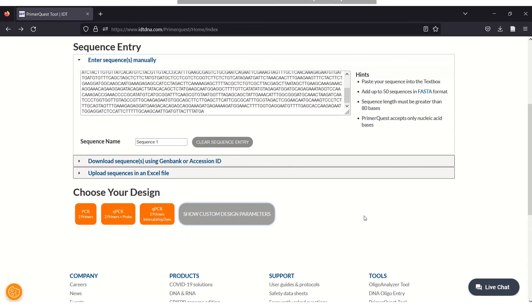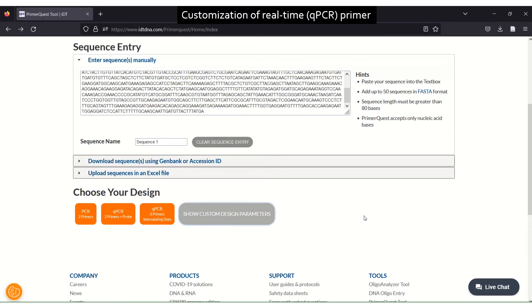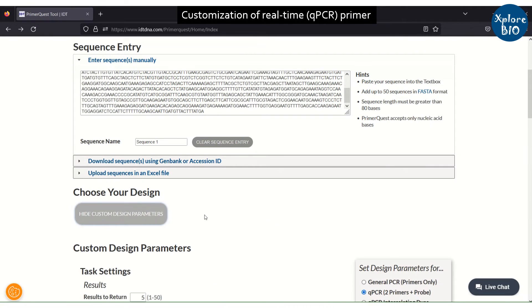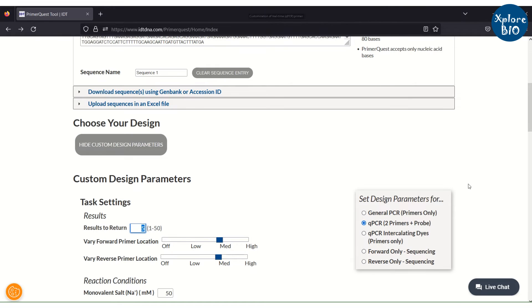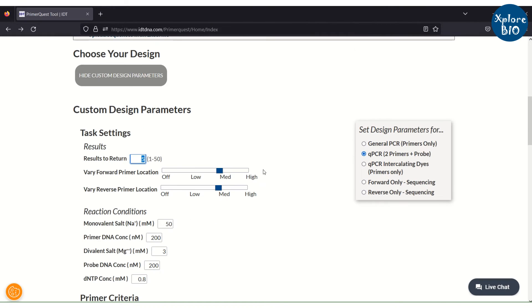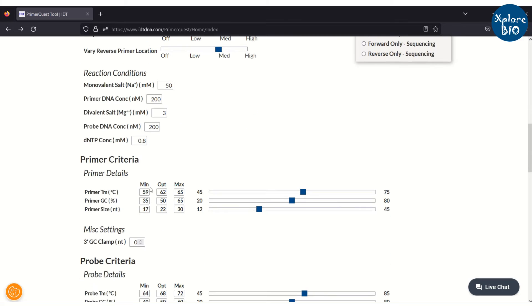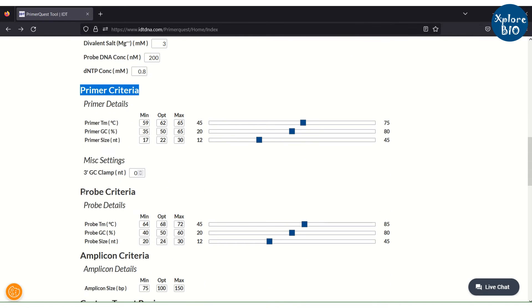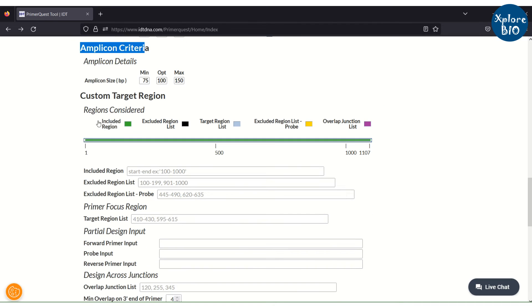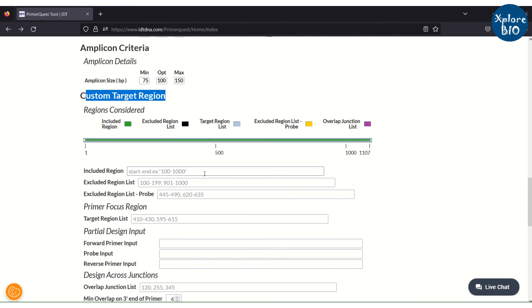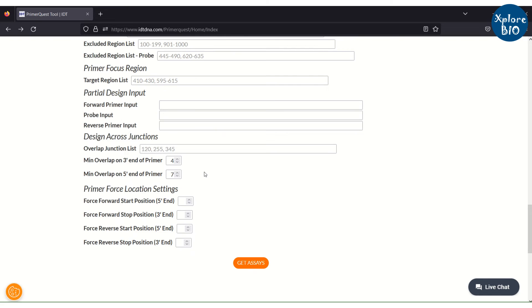If you do not want to use the default settings of the PrimerQuest Tool, it provides several options to customize primer designing if your experiment requires. For example, you can modify criteria like primer length, Tm, GC content, and amplicon size. You can also choose a specific region from which you want to design the primers and probes.